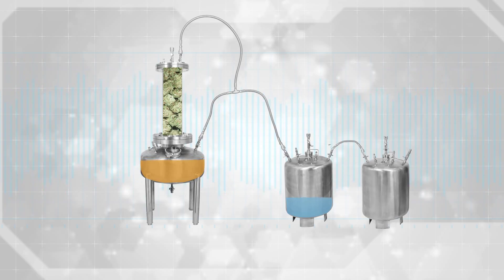The entire extraction is performed in liquid phase. Liquid solvents extract exponentially faster with more control and efficiency than when vaporized into a gas. This is due to a greater molecular density to form bonds and the ability of densely packed molecules to transfer heat and cold more efficiently.